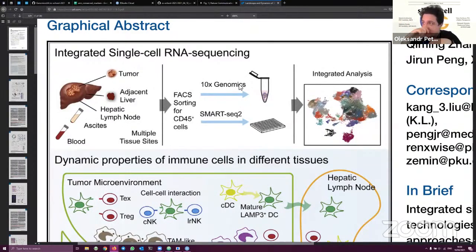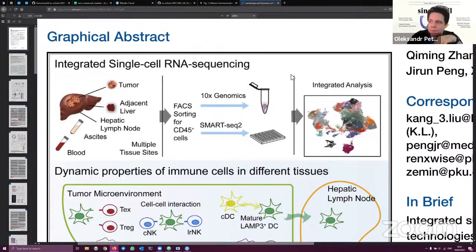So I subsampled these data sets to reduce the space they take in our repository, and I also cleaned them a little bit so it will be possible to work with these data sets without spending a lot of time on the technical steps. So with this understanding, we at least know that now we're working with liver.